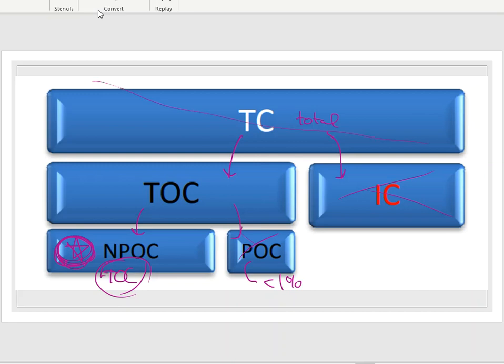And of course, it doesn't represent the total carbon up here at the top. It only represents NPOC levels. And that is it. No more. Again, unless I make a modification to my machine, a modification to how I want it to see things, this is the only feedback that I'm getting from the instrument.